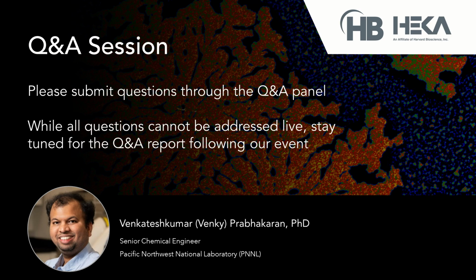Perfect. Yeah, great answer. All right, in your SECCM work for corrosion imaging, what is the common tip diameter that you've worked with? And what challenges would you expect if somebody uses nano-sized pipette tips in SECCM experiments?